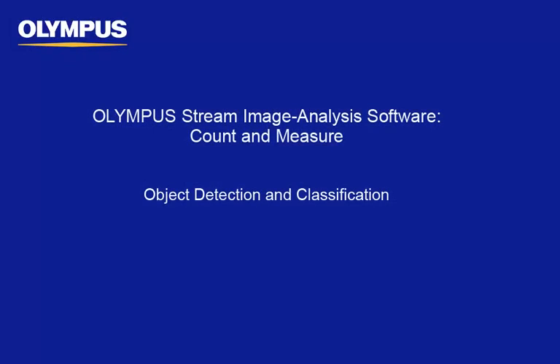This tutorial is one of many instructional videos presented by the Olympus Industrial Equipment Group. This tutorial video will provide you with detailed instructions for setup and operation of count and measure for object detection and classification within the Olympus Stream software.